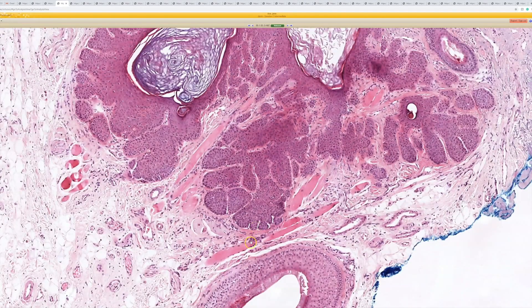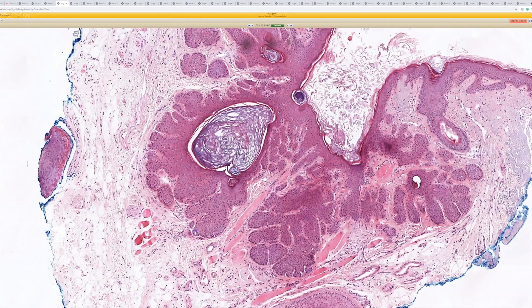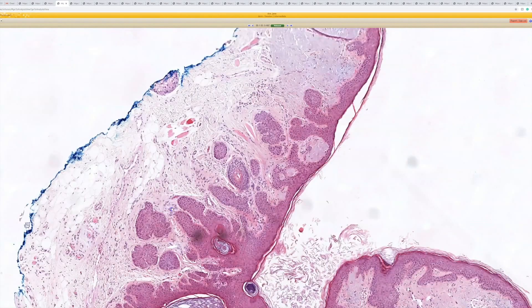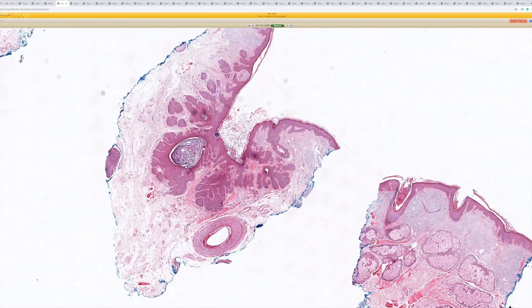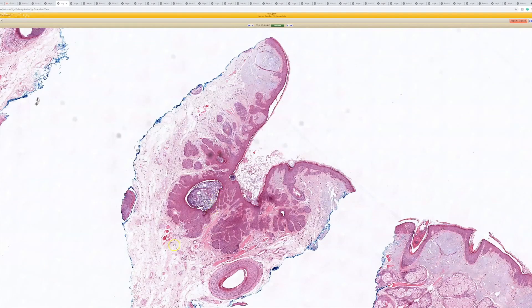Where do you think we are on the body anatomically? I see some skeletal muscle bundles there. So maybe on the face? Exactly. When you see skeletal muscle in the dermis, you're almost always going to be on the face, or sometimes the neck, because the platysma muscle can come up into the dermis and subcutis. You can see there's muscle right up here. The face would be a great place, and these often do occur on the face.